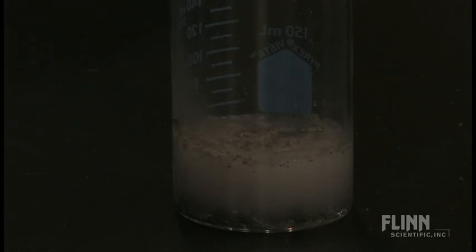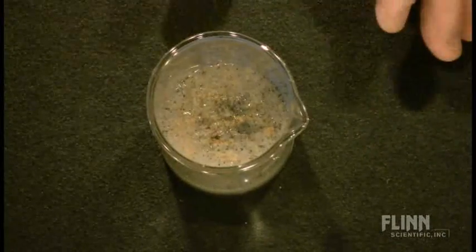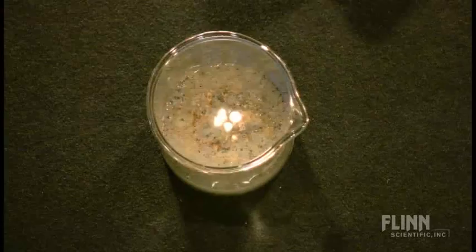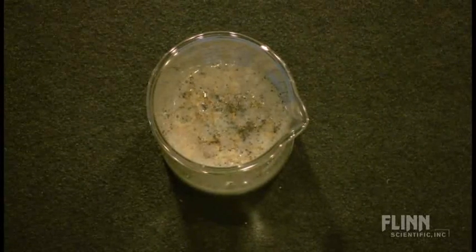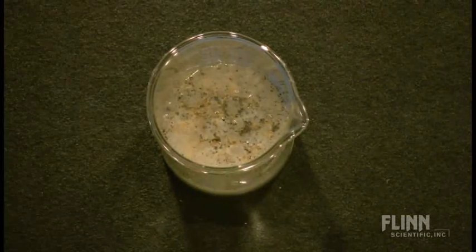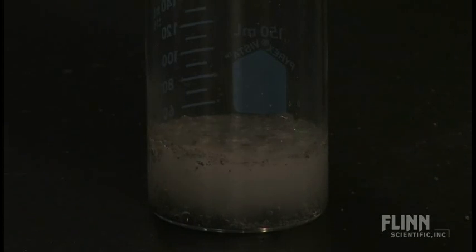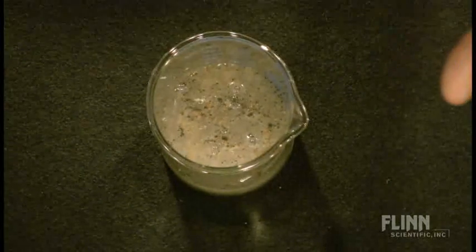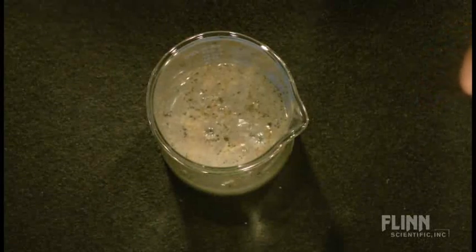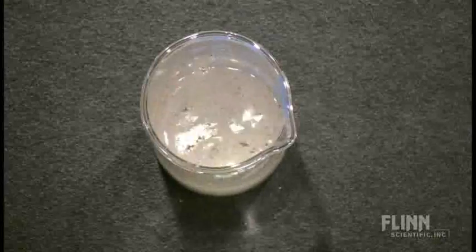You can also see, if you're looking at this from the top, that there's some grayish-looking stuff floating on the top, really fine crystals. If you burn silane, SiH4, in the air, what are your products going to be? Well, water, H2O. What's the other one? It's not going to be CO2. If it was methane, it would be carbon dioxide. In this case, it's going to be SiO2. And SiO2 is sand. And so we've come back and regenerated the sand.